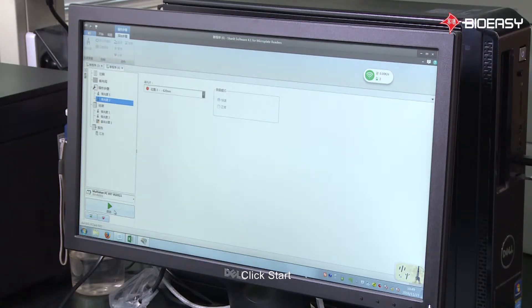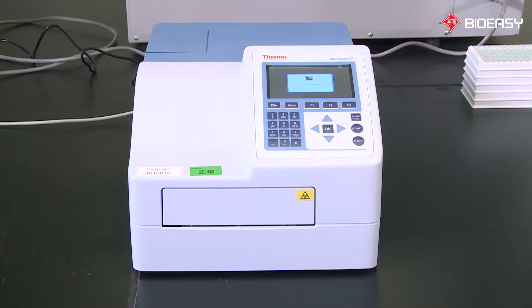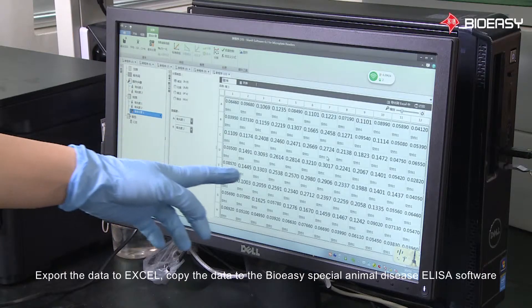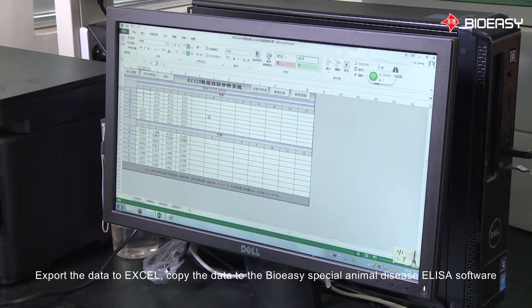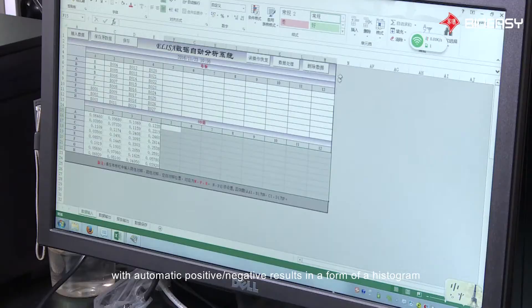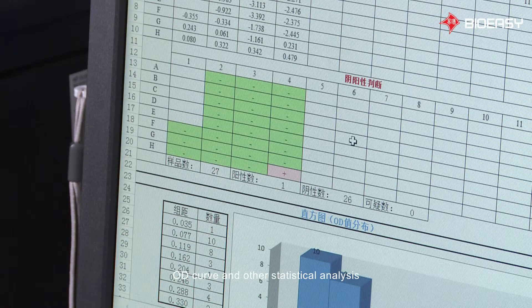Click start. Export the data to Excel, then copy the data to the BioEasy special animal disease ELISA software kit processing system. The system will analyze the tested items and automatically generate positive and negative results in the form of a histogram, OD curve, and other statistical analysis.